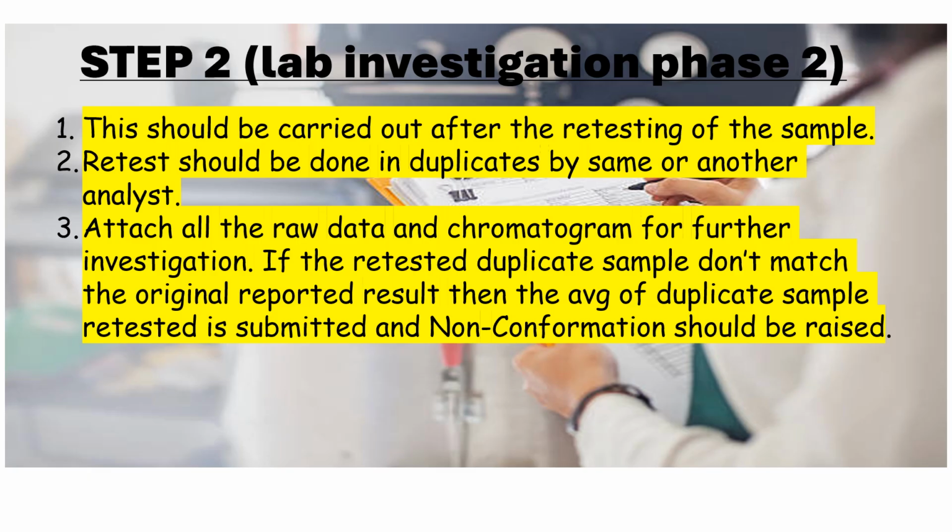And it doesn't end here, because you have produced an NRR report, that is, a non-reproducible report. So further investigation should be carried out as to why the original test result is different, where the analyst or the instrument went wrong, that the original result is not matching with the retest result.